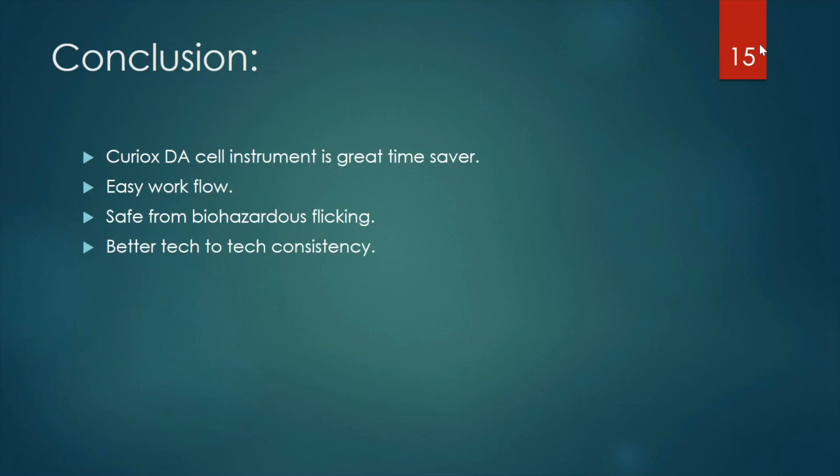But again, in case you're using a higher concentration of IgG FITC, you have to be very careful.